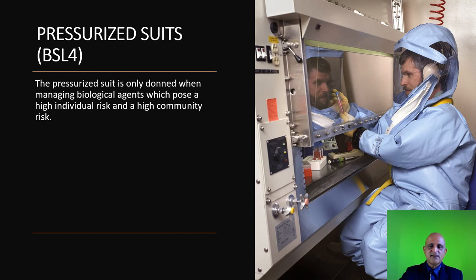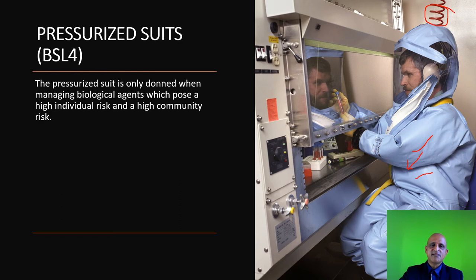Pressurized suits are generally used in a BSL-4 laboratory and are supplied with pressurized air via a tube. The suit is maintained as a positive pressure environment. In the case of a breach of containment — for instance a tear in the suit or a needle stick injury — air will exit through the suit and prevent the intake of any biological agent. Pressurized suits are extremely expensive and their usage is limited to BSL-4 and other high containment facilities.